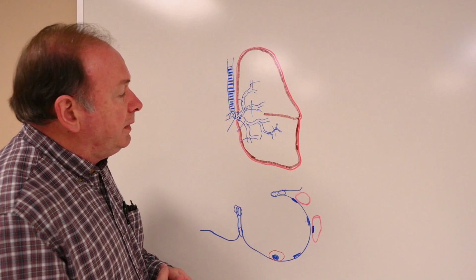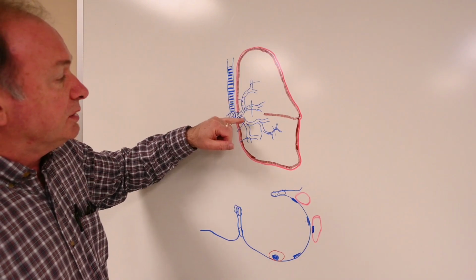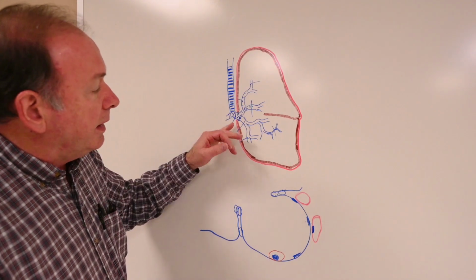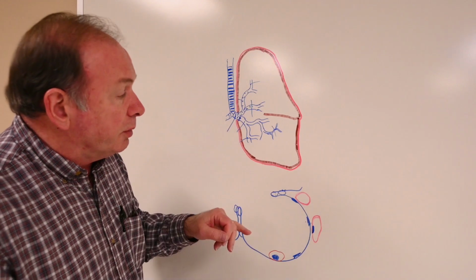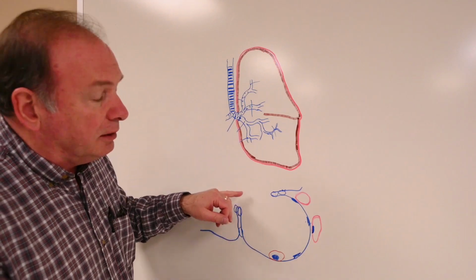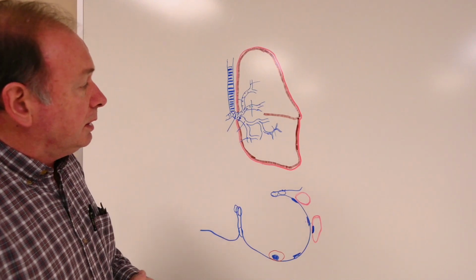dust cell in there. So what we'll do is we'll look first at the capsule, the outer layer there. Then we'll look at some of the larger passageways inside the lung and look at the material in the wall there. Then we'll look at some bronchioles, small bronchioles. We're also going to look for Clara cells, special cells in there that we'll describe. And then we'll look at the alveolar regions and the components in the alveolar region. So those are the things we're looking for in the lung.